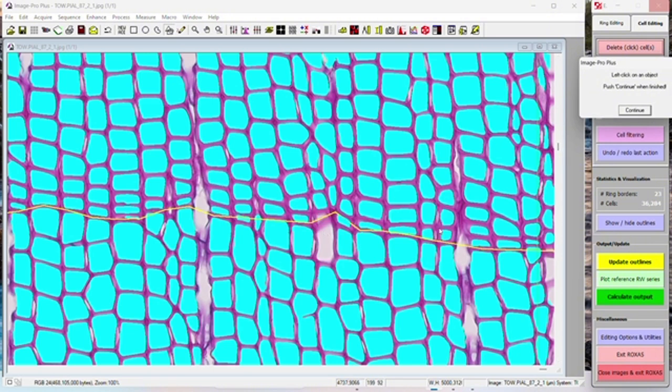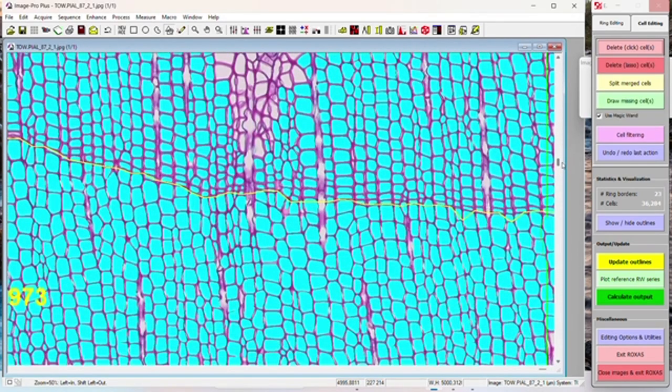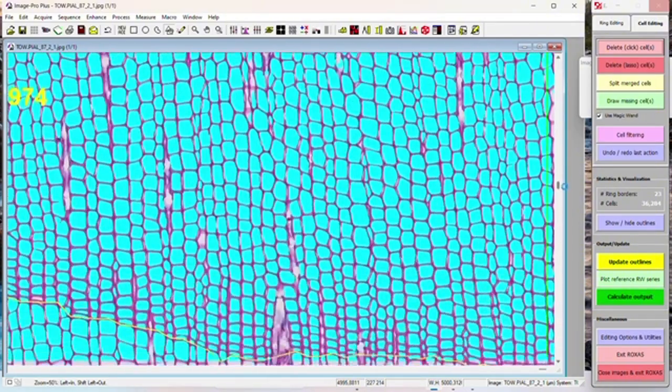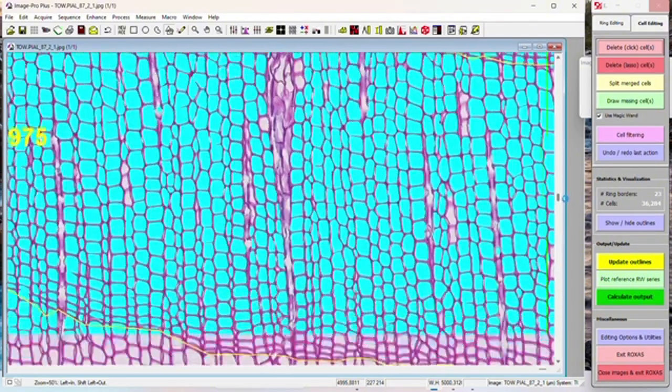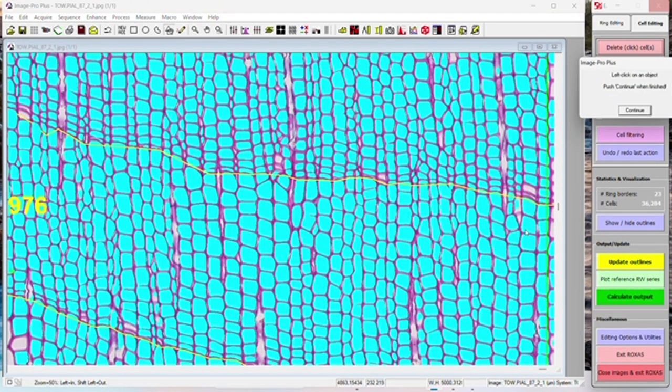So that ring didn't really have much going on in the late wood. If you see anything in the early wood, you can grab it, but honestly, there's more early wood than late wood, so we're more focused on perfecting the late wood than we are the early wood in this case. So the rest of this is looking better. That one clearly needs to be deleted.